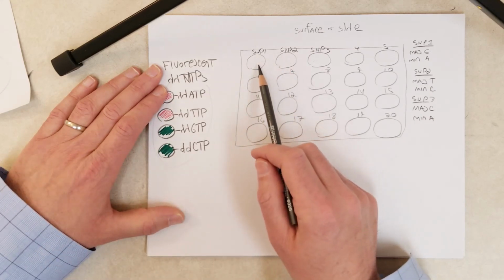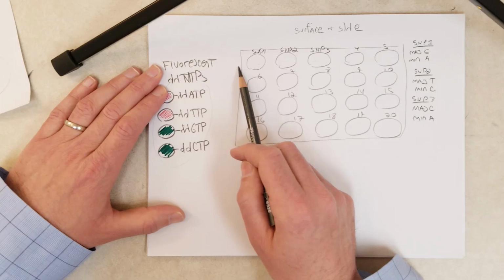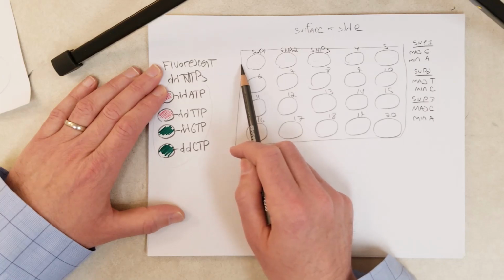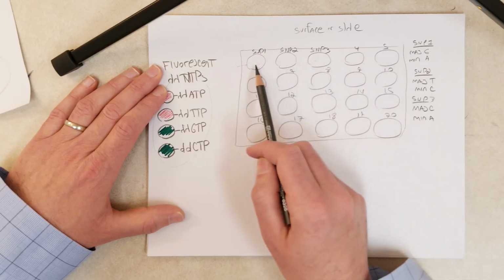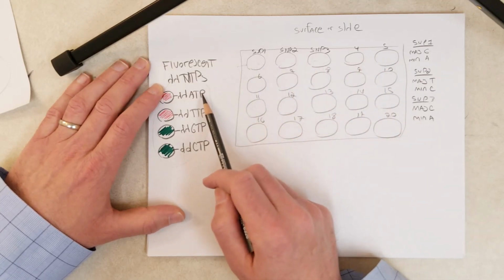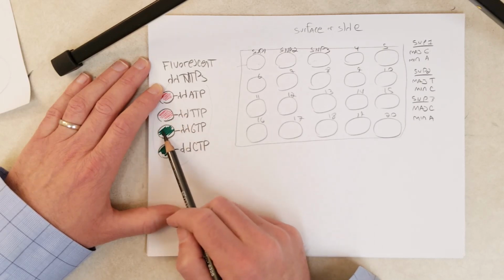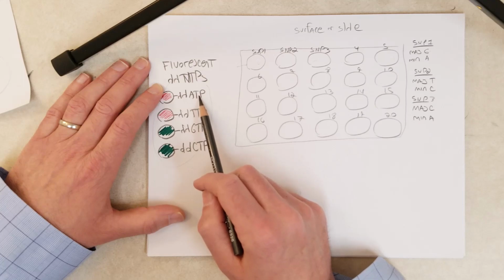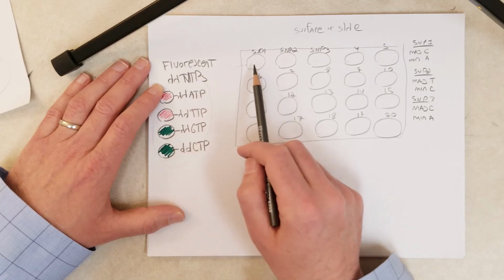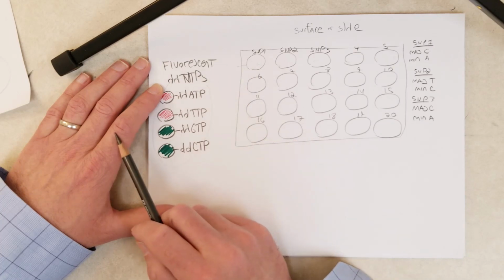Next, using a very powerful microscope attached to an imaging system and a laser, a computer will direct the laser shining on each of these beads, and each bead will emit a certain fluorescent color, either red or green, or a mix of red and green. That will depend on the ddNTP that was used to extend the oligonucleotides attached to that bead.